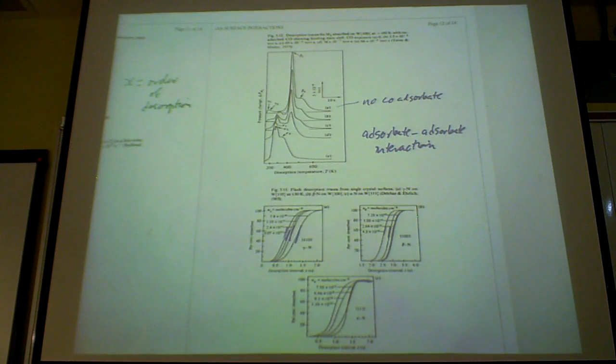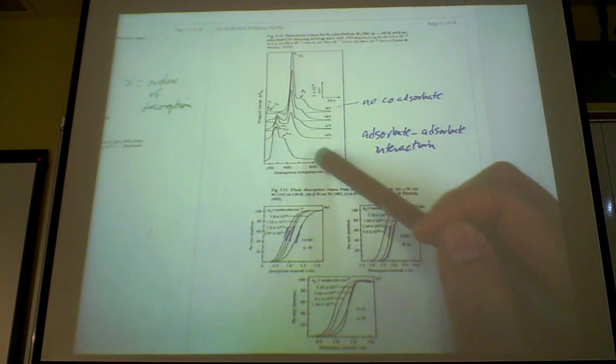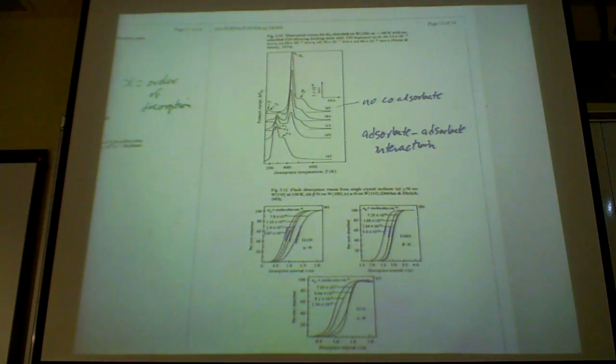There could be differences. I mean, there could be product coming out, or it could be the original reactant coming off your surface. So if you can analyze that gas that comes out and look at when it comes out as a function of temperature, that can tell you how strongly that gas adsorbs on your surface, and what kind of reaction could occur.